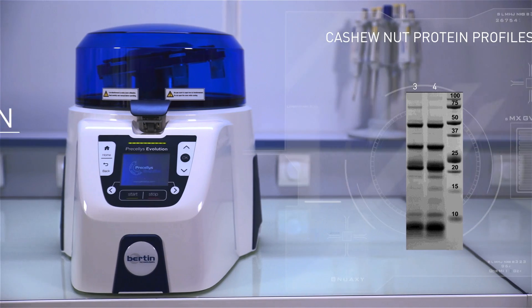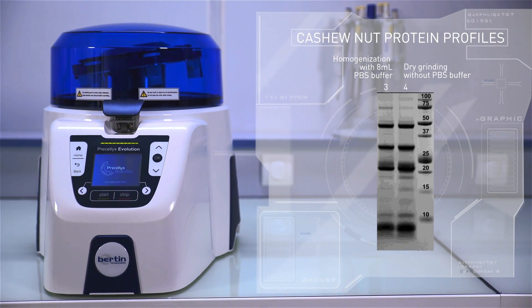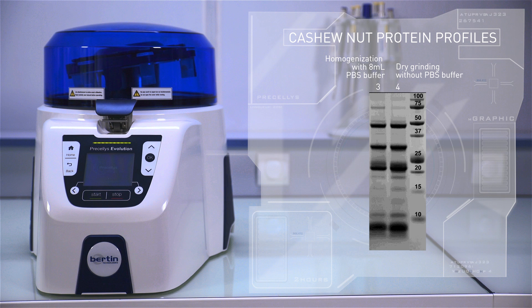The protein bands in lane 3 are obtained after homogenization in PBS, while lane 4 represents protein bands after grinding without PBS buffer. Pressilis Evolution is suitable and convenient for protein extraction.